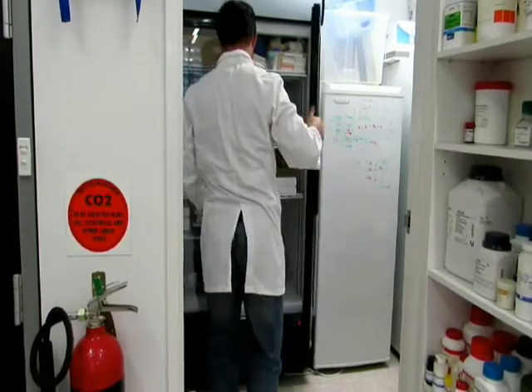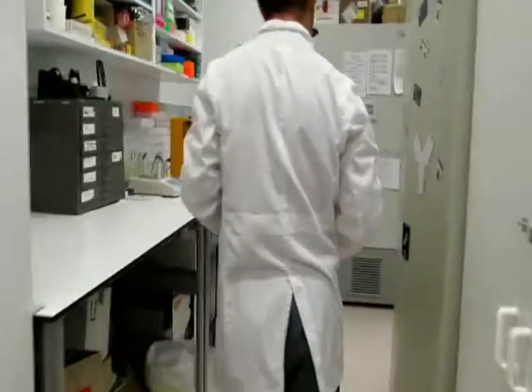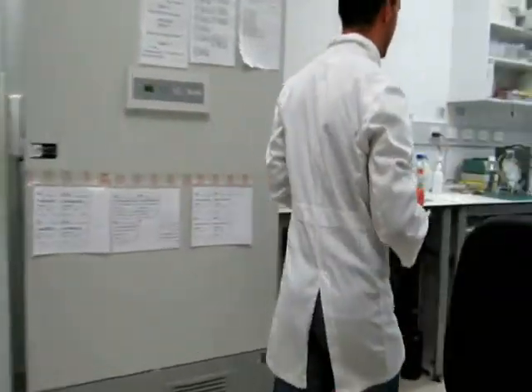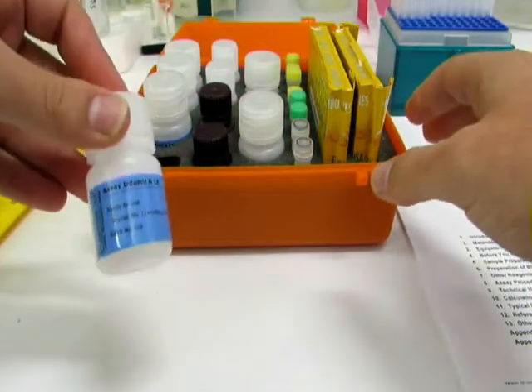Remove your rapid ELISA from the fridge and allow the components to adjust to room temperature.